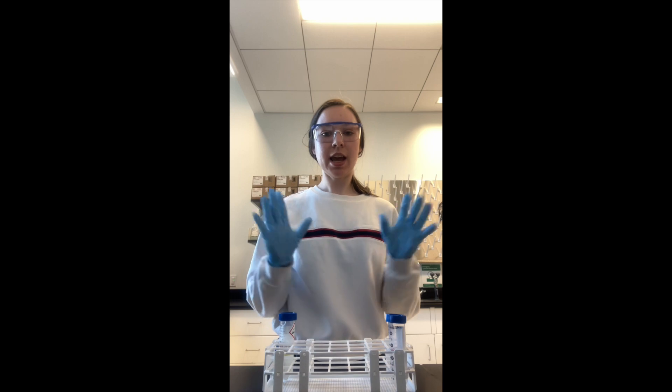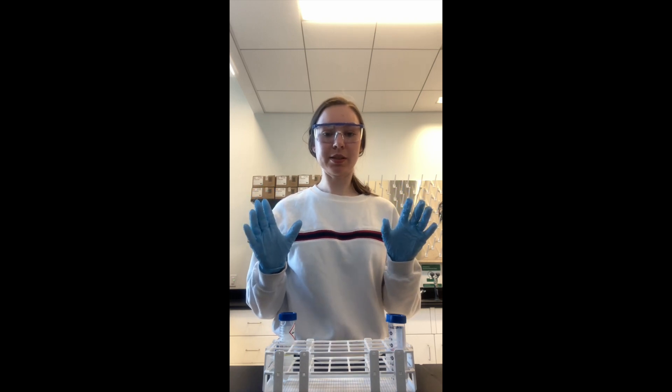The next step is to make sure you are wearing proper attire. Make sure you're wearing clothing that covers your skin including long sleeves, long pants, closed-toed shoes, and if you have long hair, make sure your hair is tied back. You also need to be wearing safety glasses to prevent against splashes in your eyes, and disposable gloves to protect your hands.